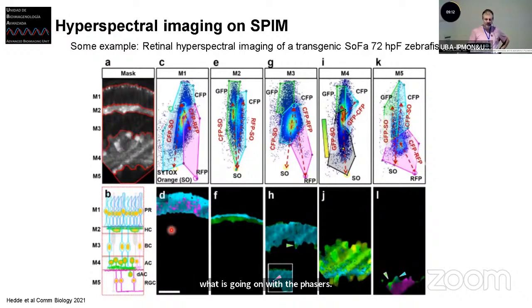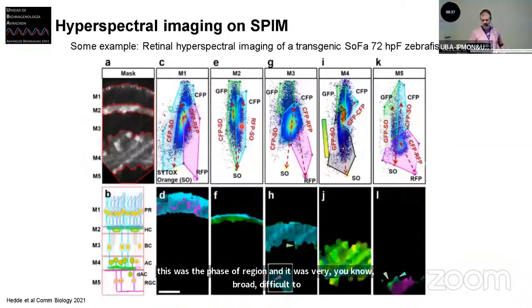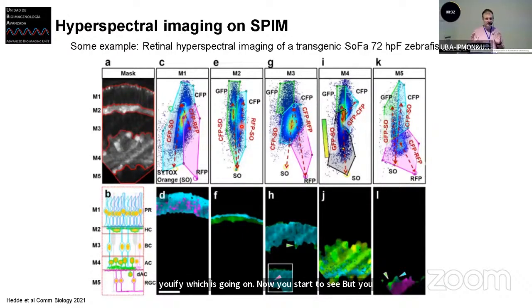and I was trying to put in words what is going on with the phasors. Basically, Andres was able to tell me, okay, this is the region that has a particular biological characteristic, this one, M1. And this is another, M2, and M3, and M4, and M5. I will not give you the proper names, and Andres is going to kill me for that because I don't remember the names. But if you isolate each of the regions and then you look at the phasor, you remember this was the original phasor. It was very broad, difficult to identify what is going on.